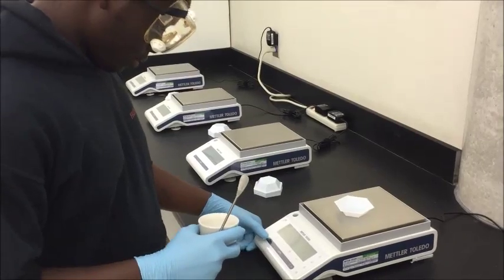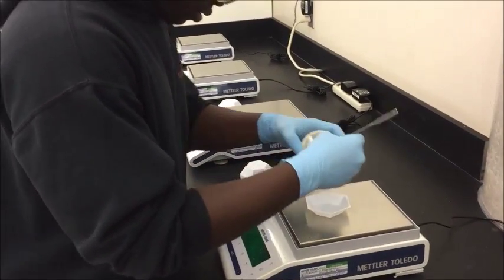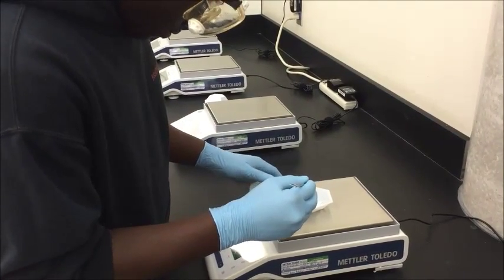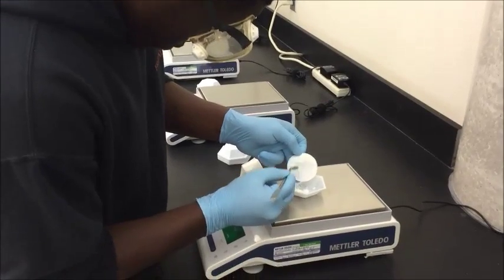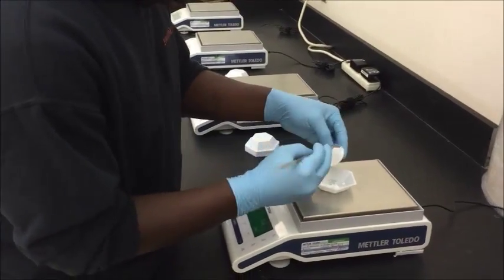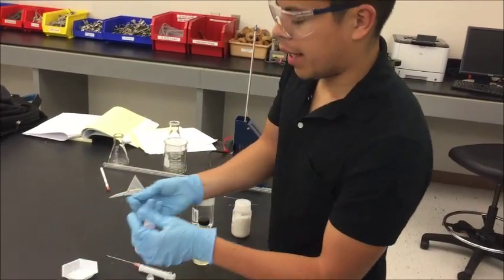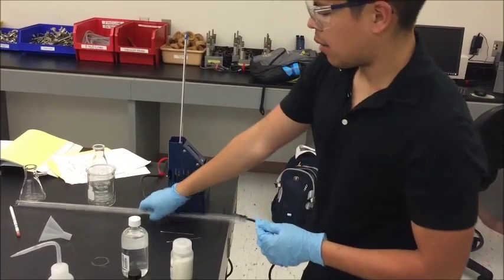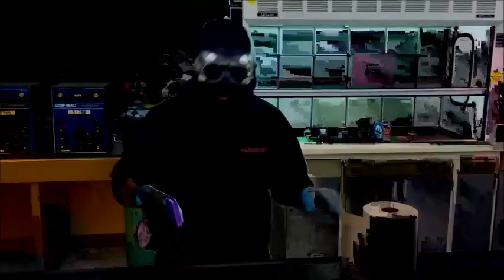Make sure you tare the scale with the container. We're now taking the melting point of our product to find out whether we have an N-ethylsaccharin or the O-ethylsaccharin product. After you've measured the melting point, you will take your precipitate and find your nearest professor who will take your NMR spectra for you. As always, make sure you clean up your station.